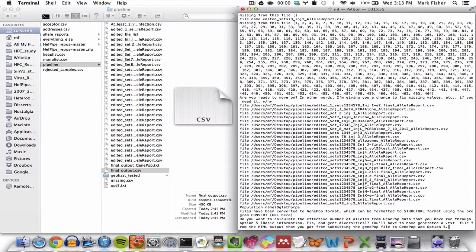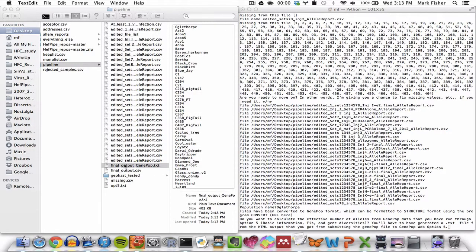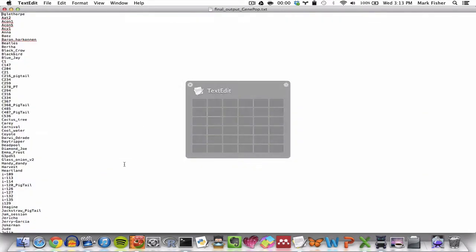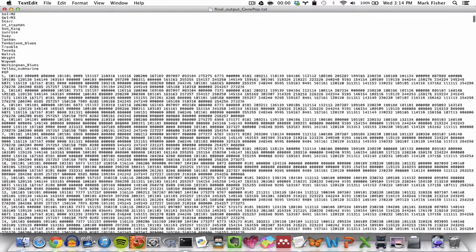So at this point, the pipeline generates a file called FinalOutputGenePop.txt, which is right here. And this is in GenePop format and ready for analysis. So here is what that file looks like.